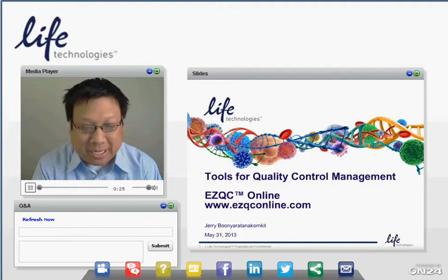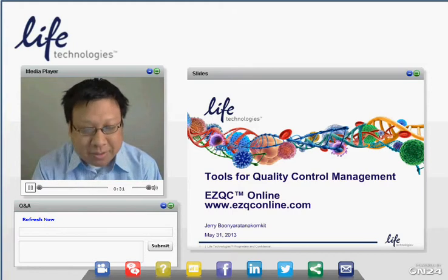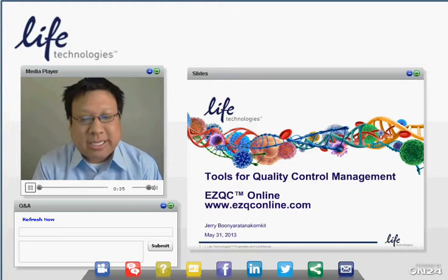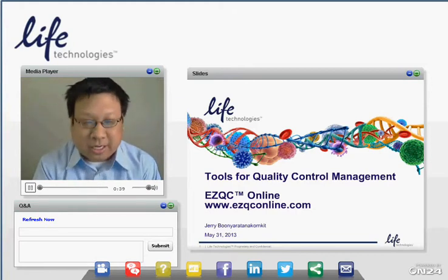Today, what I'm going to be talking about is tools for quality control management. I'm going to talk about software tools that are available, especially one of our software, which we call EZQC Online. The website is www.ezqconline.com.